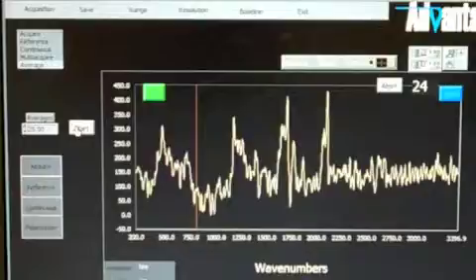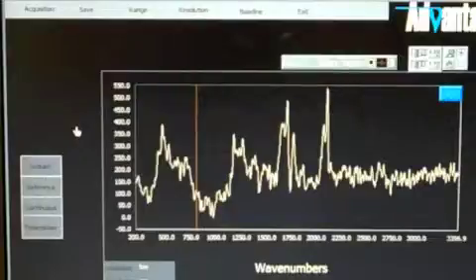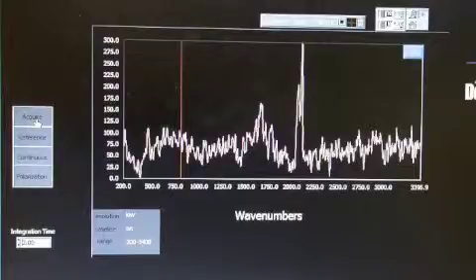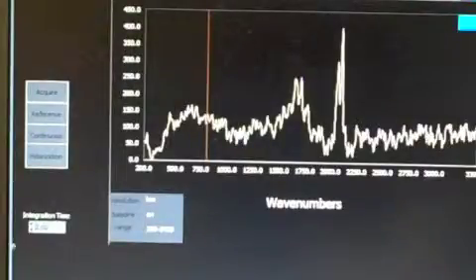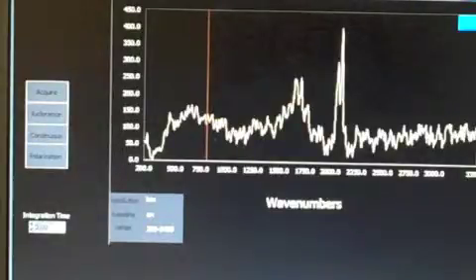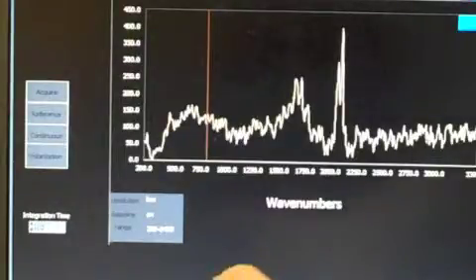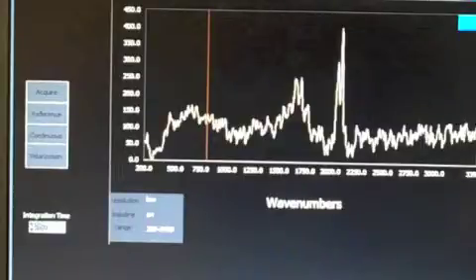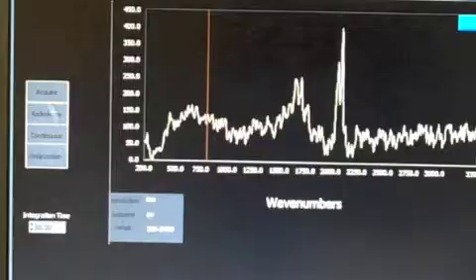The alternative approach is to increase the integration time using the little box at the left-hand side of the screen. As the integration time increases, the detector spends more time collecting light. The signal to noise ratio improves in proportion to the square root of the integration time. So if you want to improve the signal to noise ratio by a factor of two, you have to collect data for four times as long.